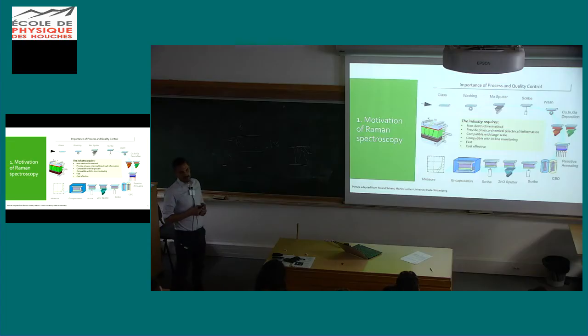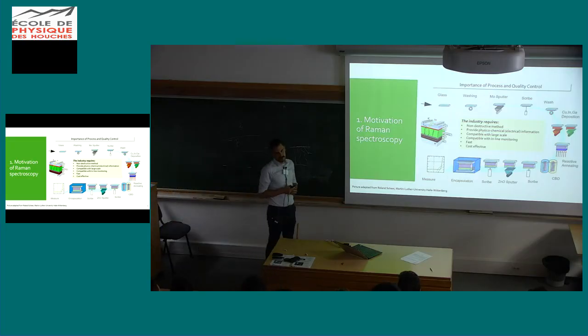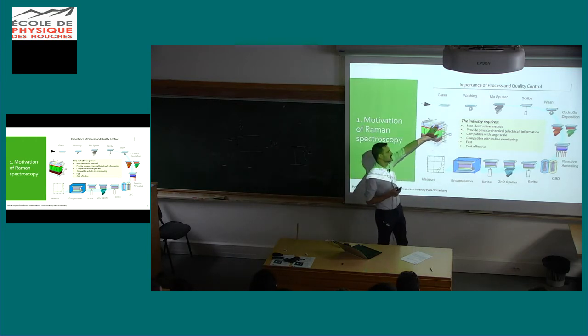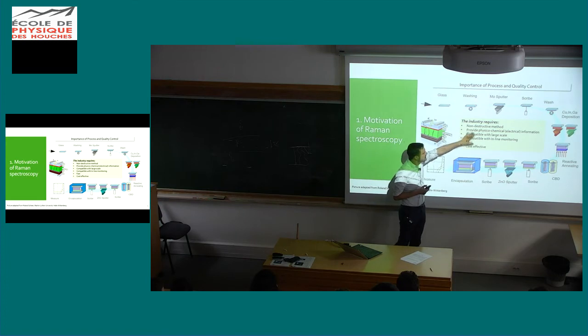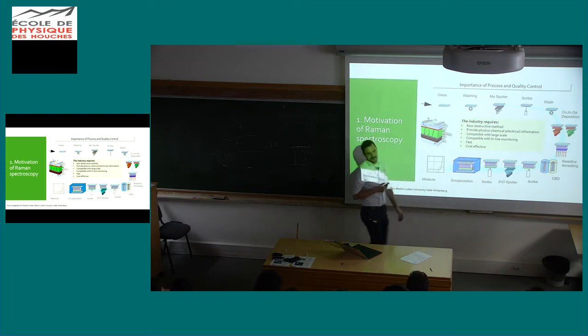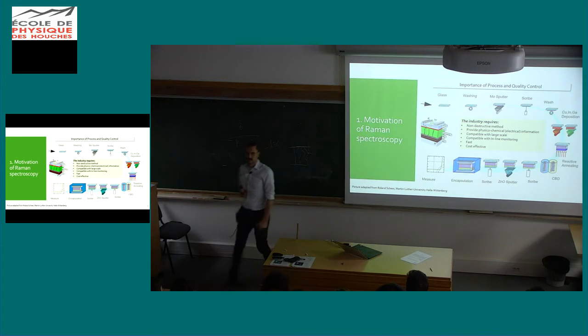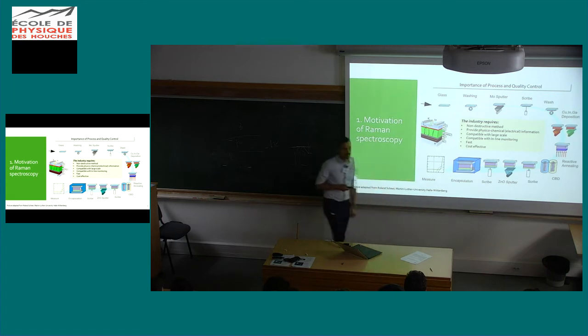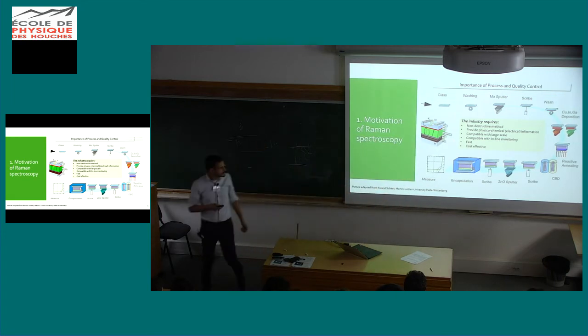Then what the industry wants, of course they always want more for less, is all this: a non-destructive method that provides physicochemical information, compatible with large scale, compatible with inline monitoring, fast, cost-effective. So many, many things. And in most cases, Raman spectroscopy fits all of them, as I will show you afterward.